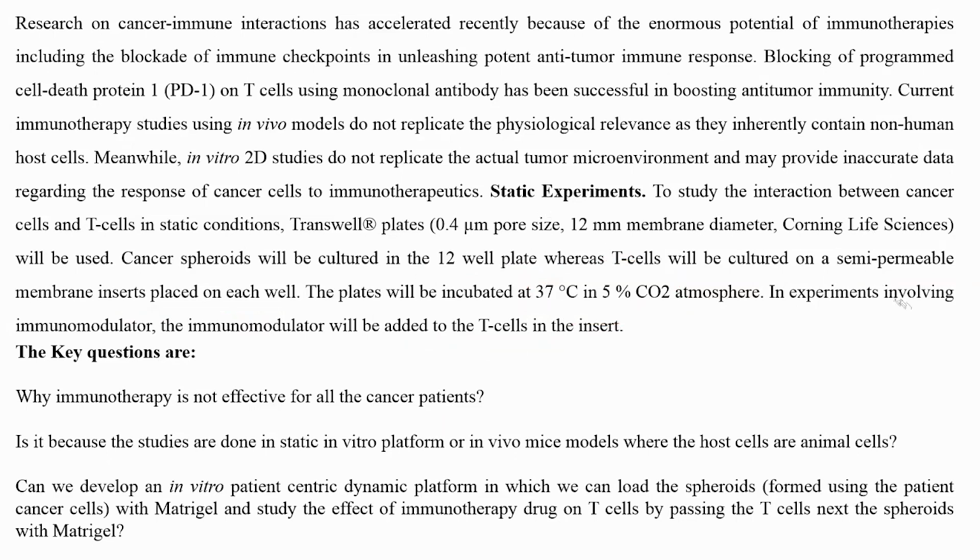What we have said is that you take this well, load the T cells, right, and everywhere there is matrigel, there are tumor spheroids here at the bottom and T cells are here with media, right.